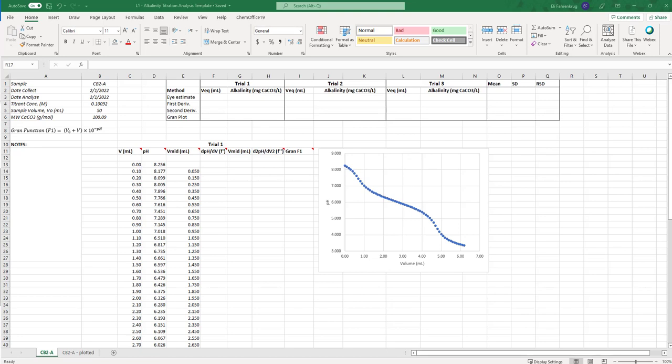This is a quick tutorial walking you through the various types of titration analyses to determine the equivalence point of a potentiometric titration. We're going to use a specific example of alkalinity since we'll do that frequently in the 241 course, but this would work for any potentiometric titration. I'll also provide you this as a template, but it's important to know how the computations are made so that you can adjust them and input your own data as you collect it in the class.